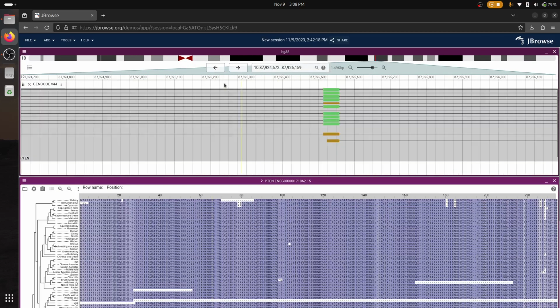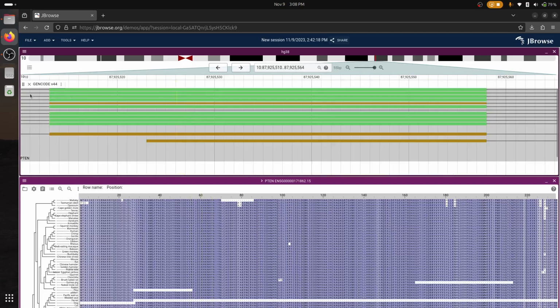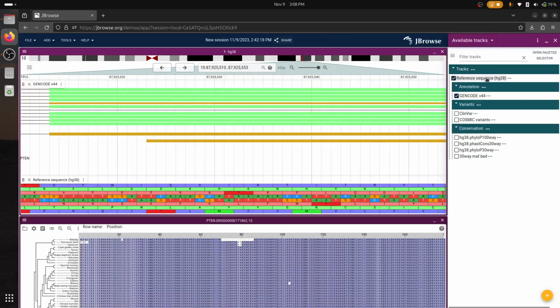on the genome all the way down to the base pair level, and we'll see that if I'm highlighting over, say, the letter H here, that's also highlighting the letter H on the second frame of that protein translation, the green H. And that corresponds with the green color of the transcript above it. Again, N, K, H, K, S. So there's good correspondence there.